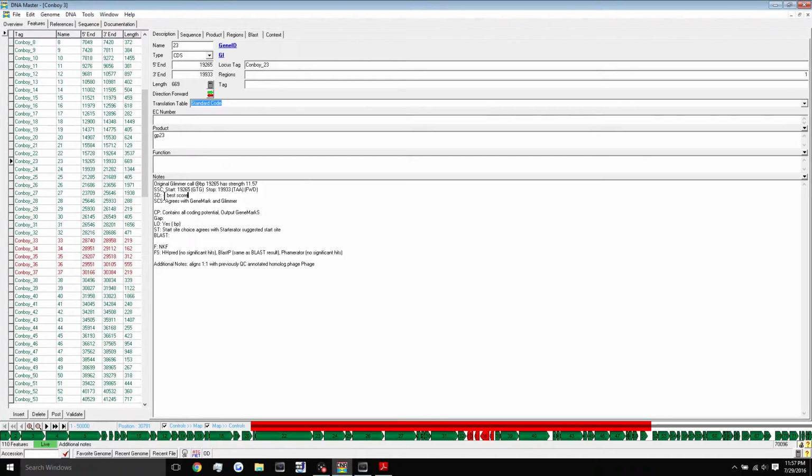Especially on the next category, we're going to work on SD. If we open up the frames window that we'll need to get the SD score without posting, it's going to get rid of the change that you just added, which is a little bit annoying sometimes. So definitely post. Alright, so now that we posted, we're going to fill out the SD section.